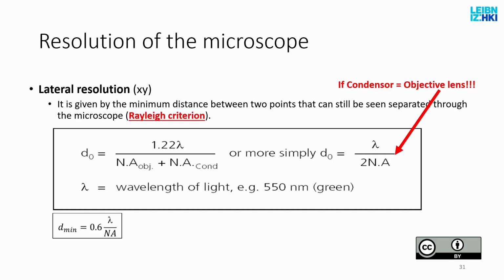Unfortunately, of course, the most typical nuclear DNA label is blue, which is the most unfortunate color for such a large object. If you want to resolve DNA or RNA clusters, of course, then it's advantageous to have a blue color, DAPI or Hoechst, for your label. But if you are just counting them and you have an orange or red label for nuclei, by all means use it. You will not suffer because they are micrometers large. And then use the lower wavelengths, the blue ends, for the smaller objects.